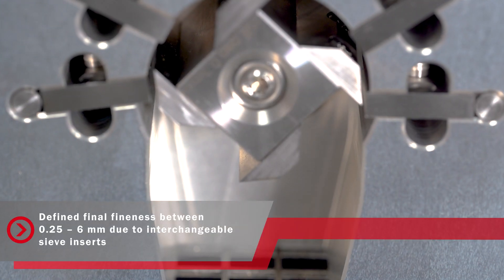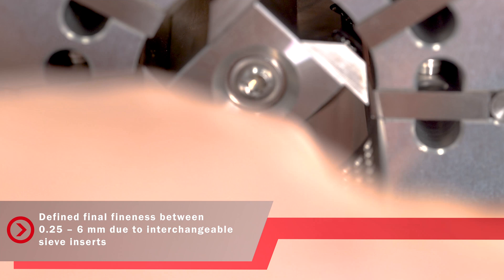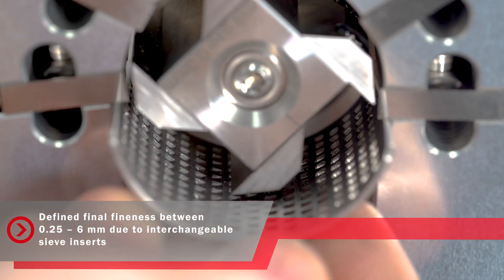Please use the sieve required for your application needs. It will determine the final fineness of your sample.